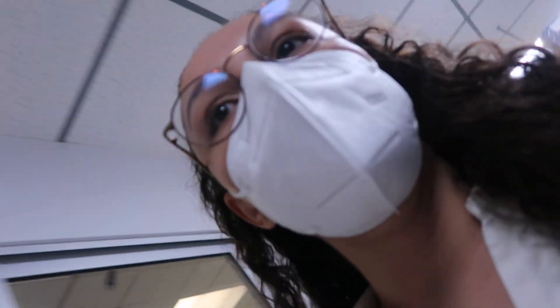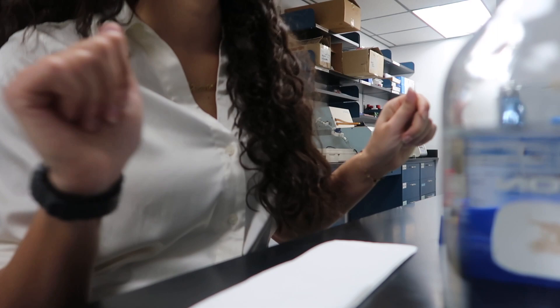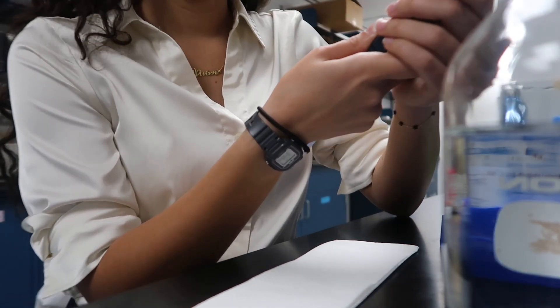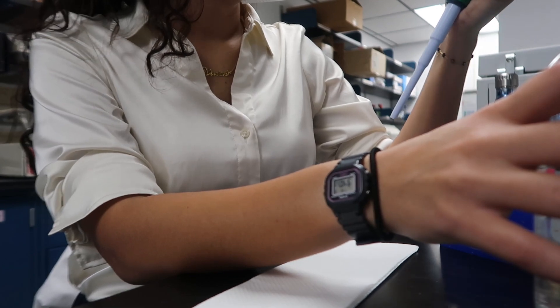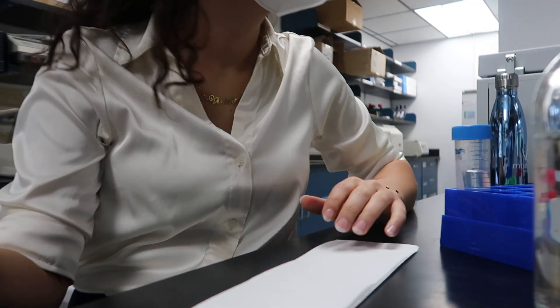Okay, so I got my 500 milliliters of 1x PBS and 250 microliters of Tween. So I'm going to grab my 1,000 microliter pipette and make it say 250. And I'm going to grab the Tween. 250. Perfect. Tween.